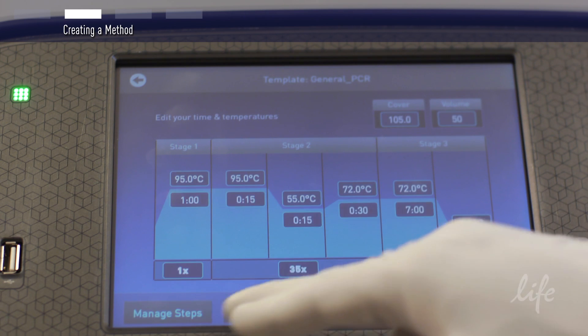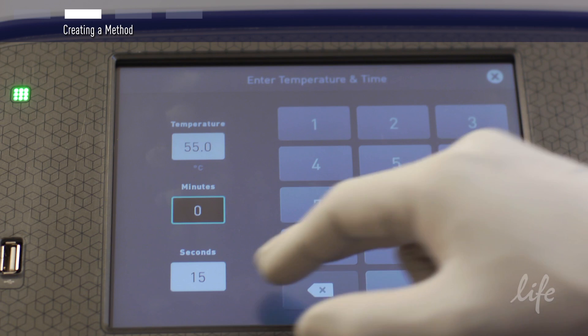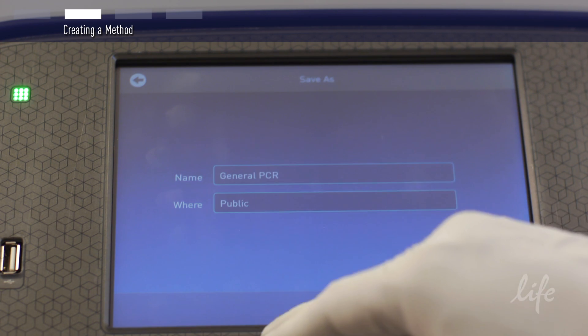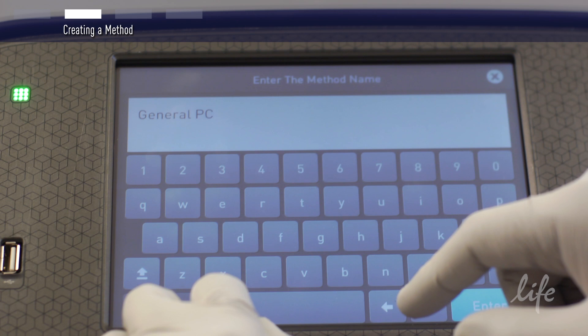Enter your cycling conditions, temperatures, and times, and enter a name for your protocol. In this case, we will call it MyProtocolA.